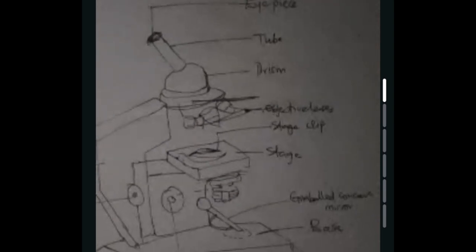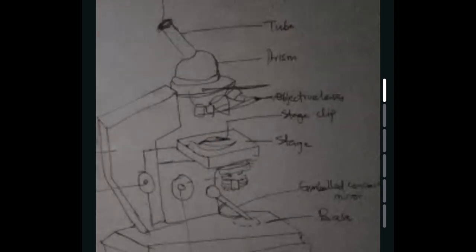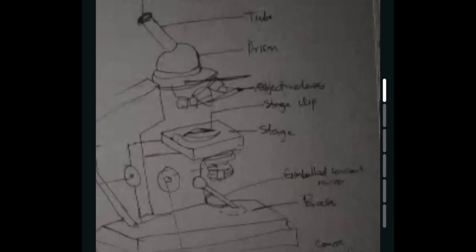Still have more. What is this, everyone? This clip. What's it called? I was answering that one before. I said nose piece. Number 6. Sorry, nose piece. Okay, you are right, my dear. Nose piece. Okay.